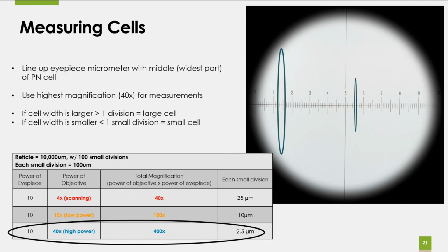Some of it is going to be up to your own discretion. It's as exact a science as I can get it to be, knowing that we have the scale available. I don't know if you have one on your microscope, but we can easily order one and make it available for you. You can use this one as an example just to see what it looks like. This is the exact view that you would see: these 10 large tick marks and then all the small divisions between.